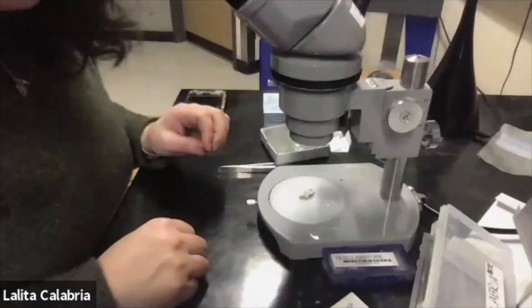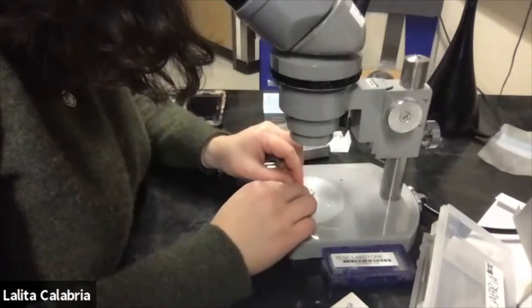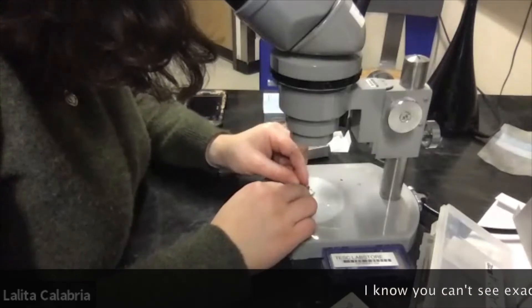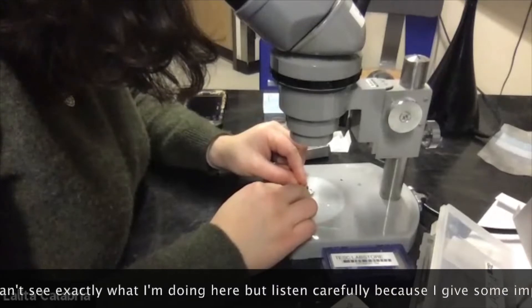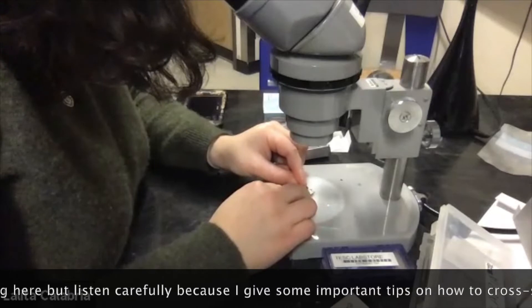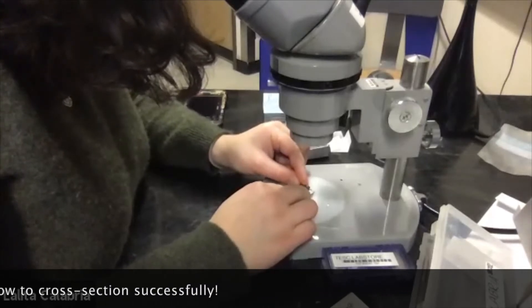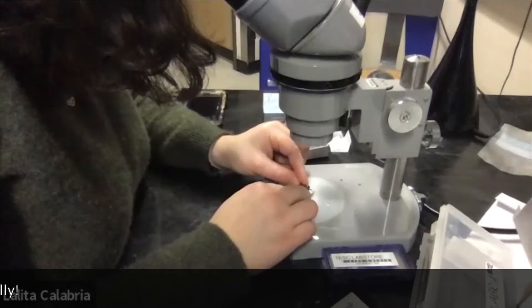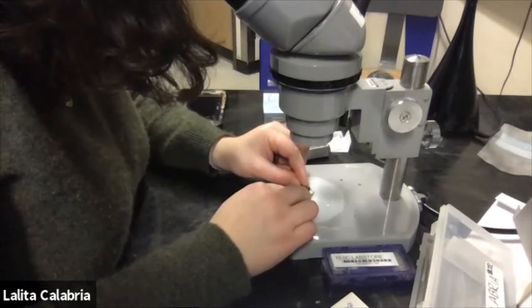I've cut the apothecia right down the center with my razor blade, and now I'm going to make tiny thin sections — trying to make them one cell thick so I can visualize the apothecia in cross-section. I'm just steadying my razor and carefully slicing as thin as I possibly can. You're really trying to make these one cell thick, which is not an easy task. The lichen is dry, which makes it a little easier to slice through, but you don't want a fan on because you need to stay steady.